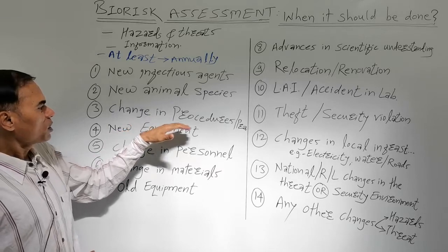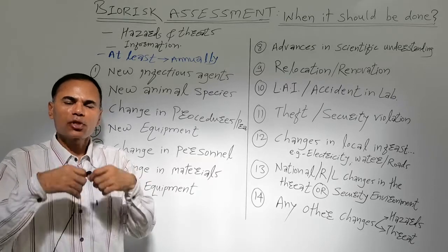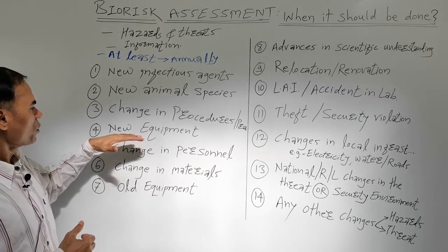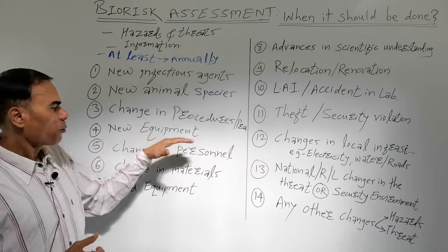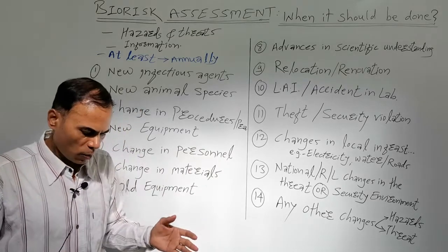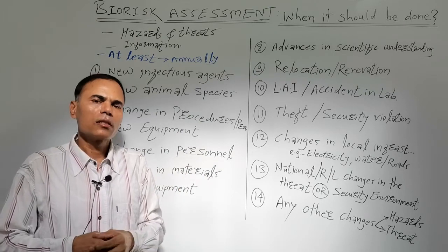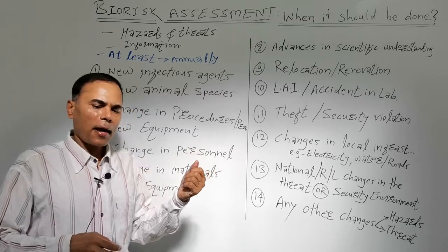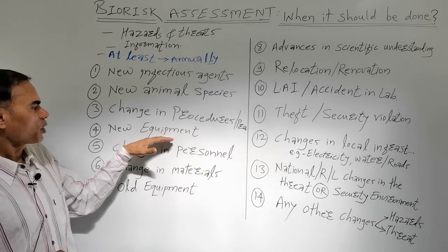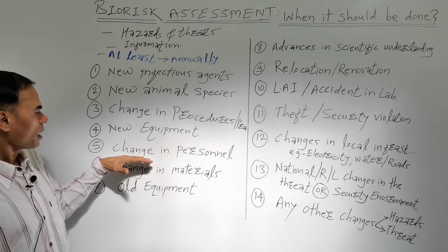Then another scenario, change in procedures or practices. When you are changing the procedures or protocols, risk reassessment needs to be done. Another scenario is when you are bringing new equipment into the laboratory. All the personnel using this equipment should be trained and familiar with the safety aspects of the equipment. For this purpose, risk assessment should be done when you have high-end or new equipment in the laboratory.